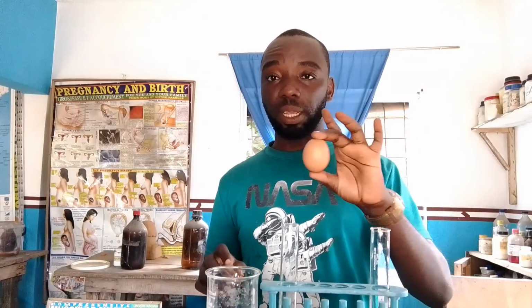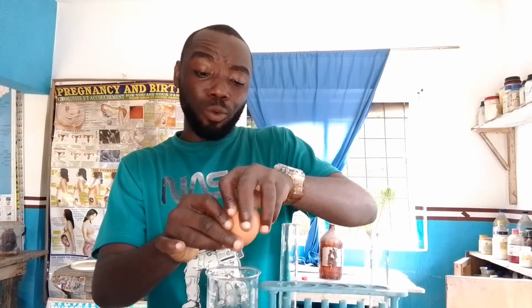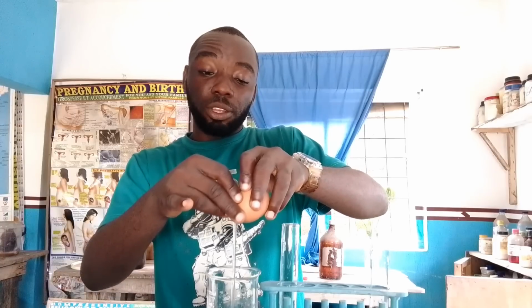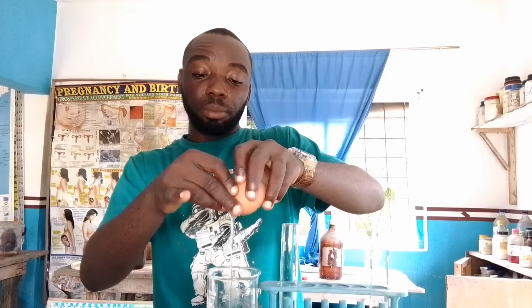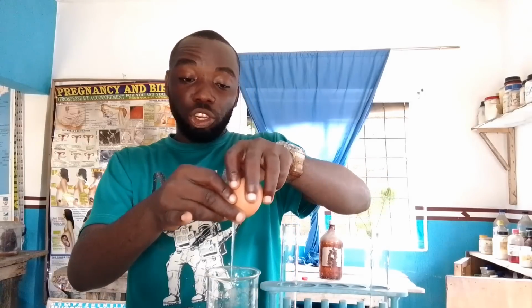So we have our syringe here, we have our egg here. First of all, let us break the egg. This is a raw egg. What you are going to be using for this test is just the egg white, that is the albumin. The yolk is not needed in this practical. So we do everything possible to extract just the albumin only, leaving the yolk.